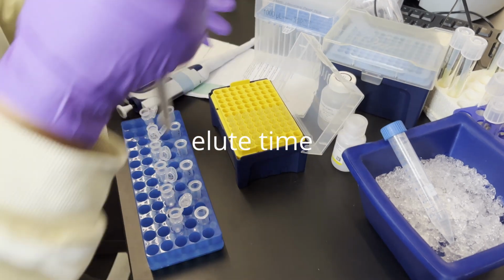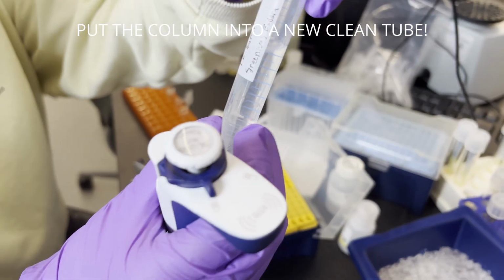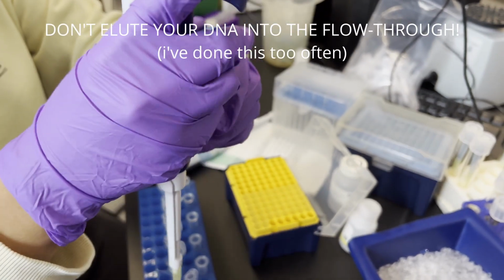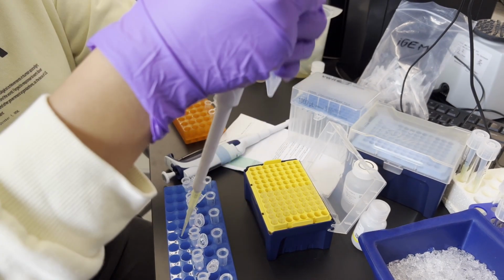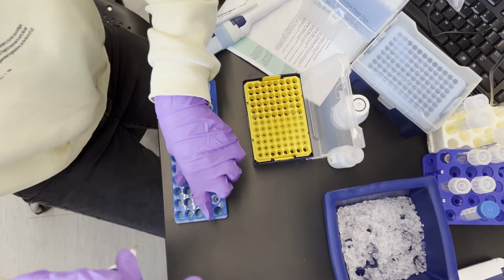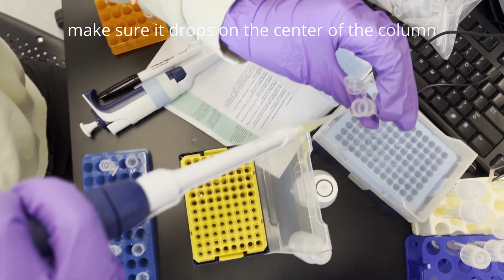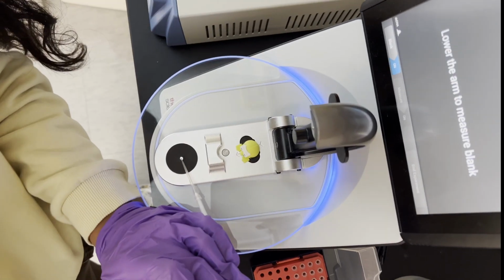Finally, we can elute our plasmid. Be sure to move the column into a new, clean microfuge tube. If we elute into the contaminated collection tube, all of our purifying efforts will go to waste. There are several recommendations to increase yield on this step. You could incubate with elution buffer longer, or you could heat the elution buffer to 50°C. You could try these, but just make sure that the elution buffer touches the column matrix without touching the column directly with the pipette.